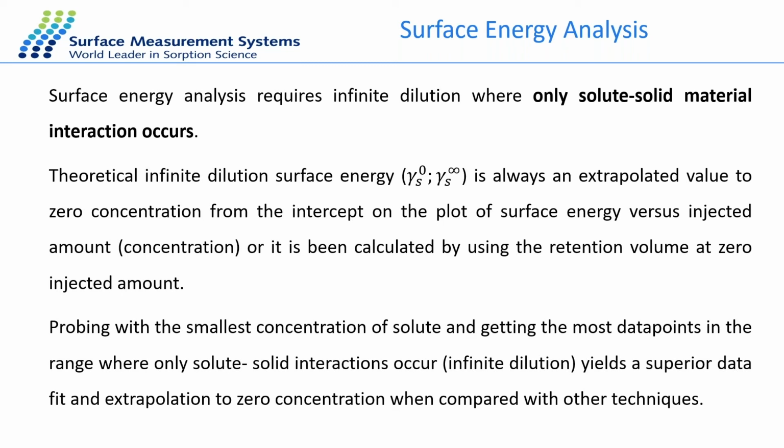During the surface energy measurements, it's really important that you have to be in infinite dilution. So you inject the probes in infinite dilution, whereas only solute and solid material interaction occurs. Compared with the BET, where you have to really saturate the surface with the adsorptive, so you have to reach a monolayer coverage, so the surface is really saturated with the probe, the solute molecules. In case of surface energy, you don't need to. You need to be in the infinite dilution.